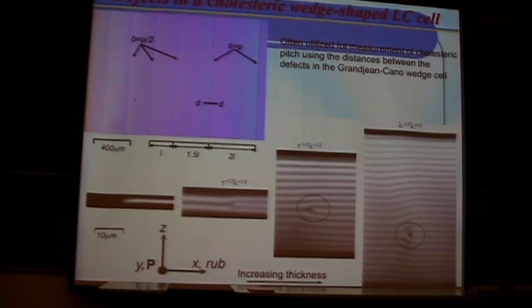You can see that the thinner lines shown here correspond to the edge dislocation in the cholesteric layer structure, and they correspond to the tau minus 1/2, lambda plus 1/2 disclination pairs depicted here.